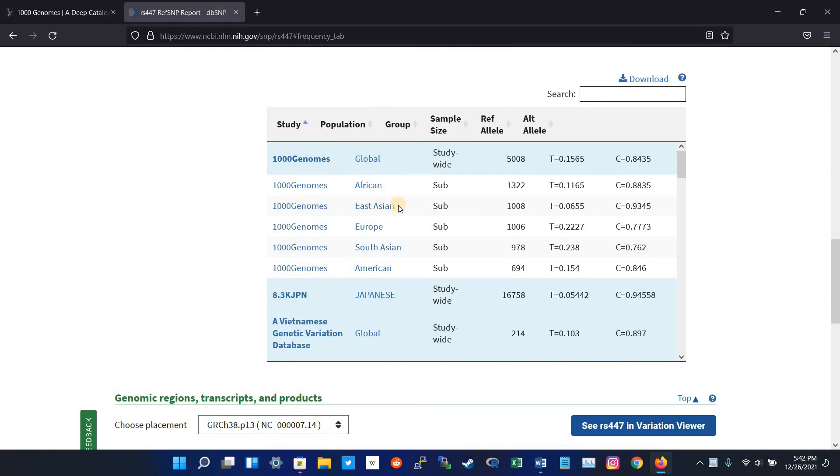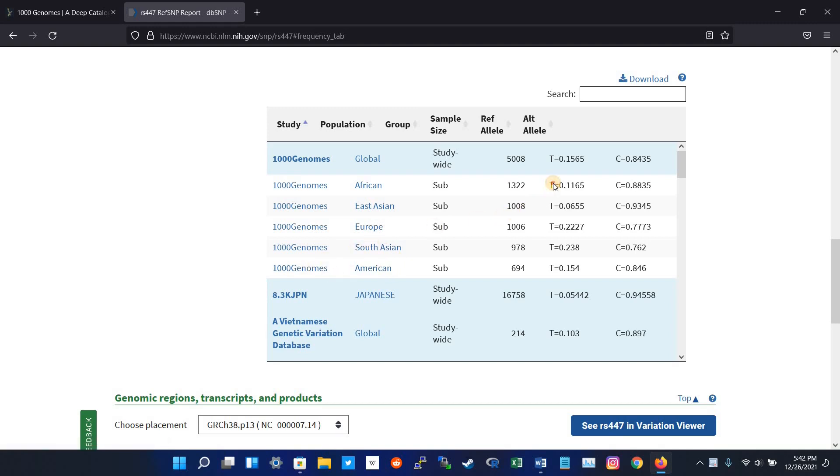Here we have Africans, East Asian, European, South Asian, and Americans in the Thousand Genome Project. Here is the reference allele, and here is the alternative allele frequency.